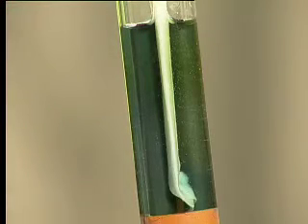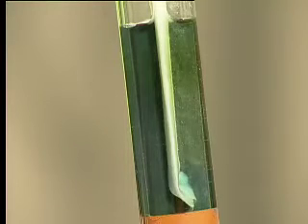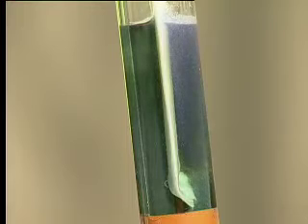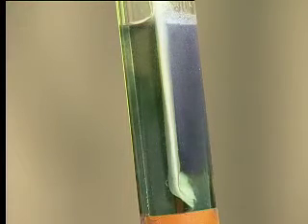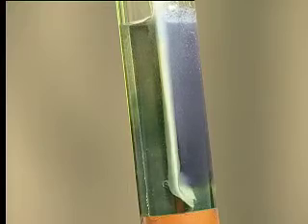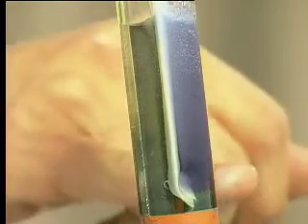Let's connect our power supply and see what happens. It's a fairly instant reaction. We should see color change almost immediately, and then we'll take a closer look. Once we've connected a little bit of power, you should see some bubbles happening. I've got some bubbling here, and exactly as we expected, one side is changing to a blue color, the other side to a yellowish color, staying mostly green. We can see a nice separation between the 2 sides here.